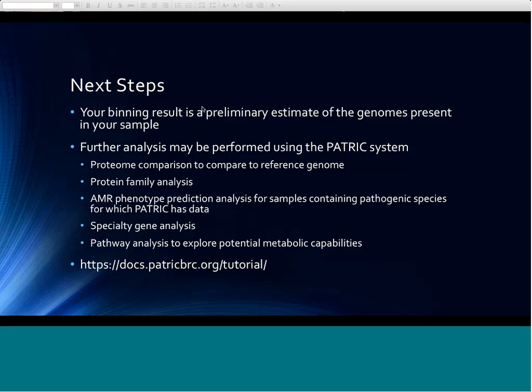Can I take that? What? Who? Sorry. Wake up the taxonomy guy. They're so traumatic, our taxonomy guy blacked out the question.